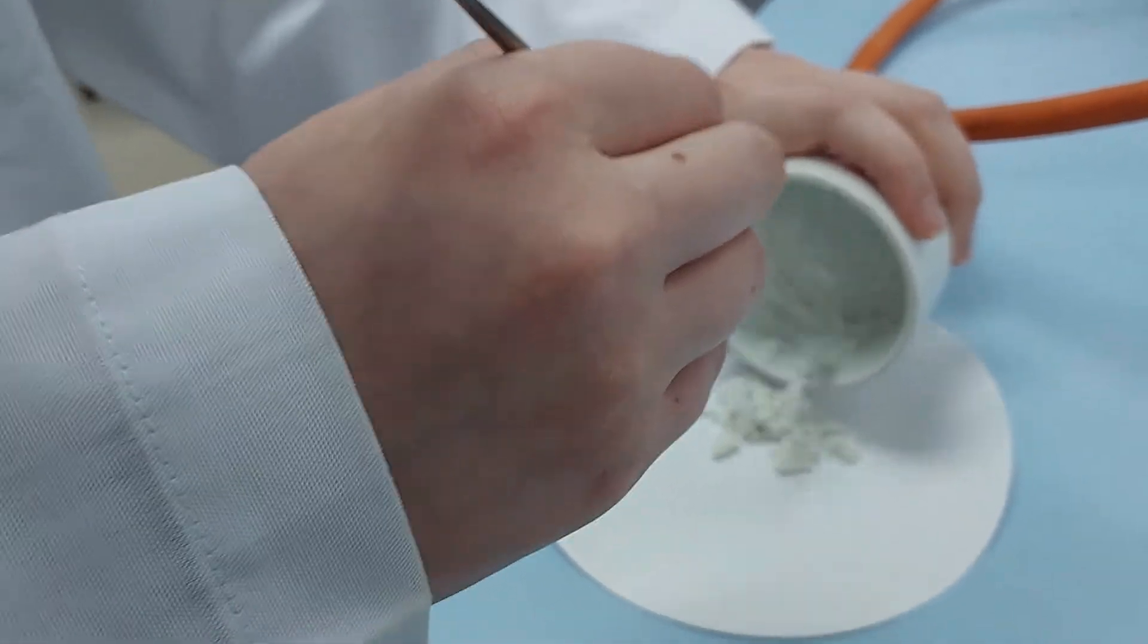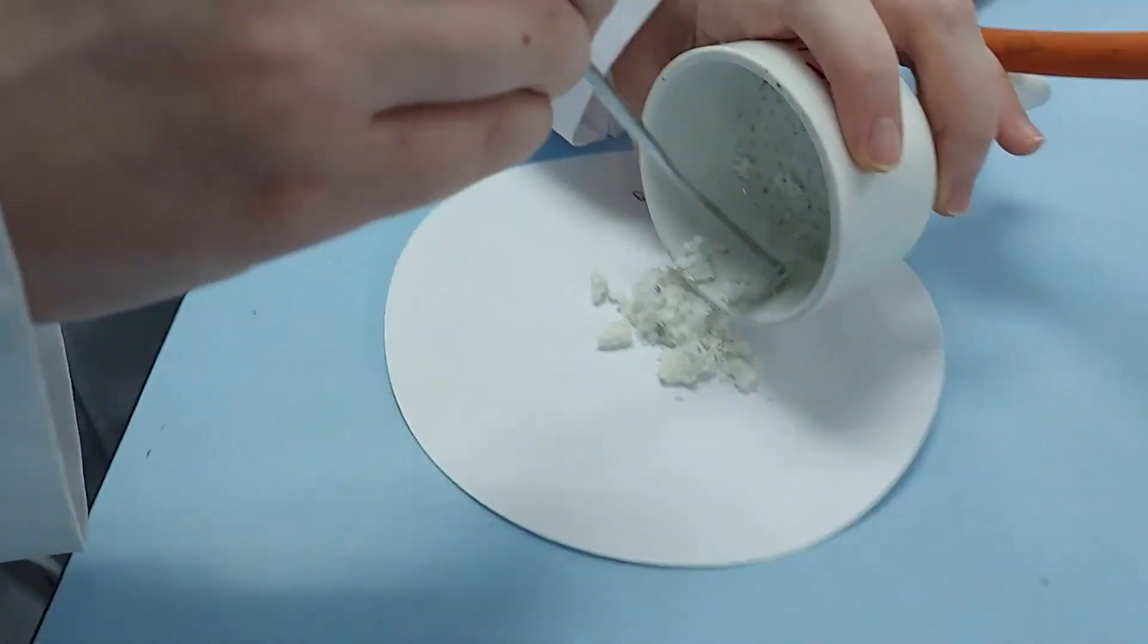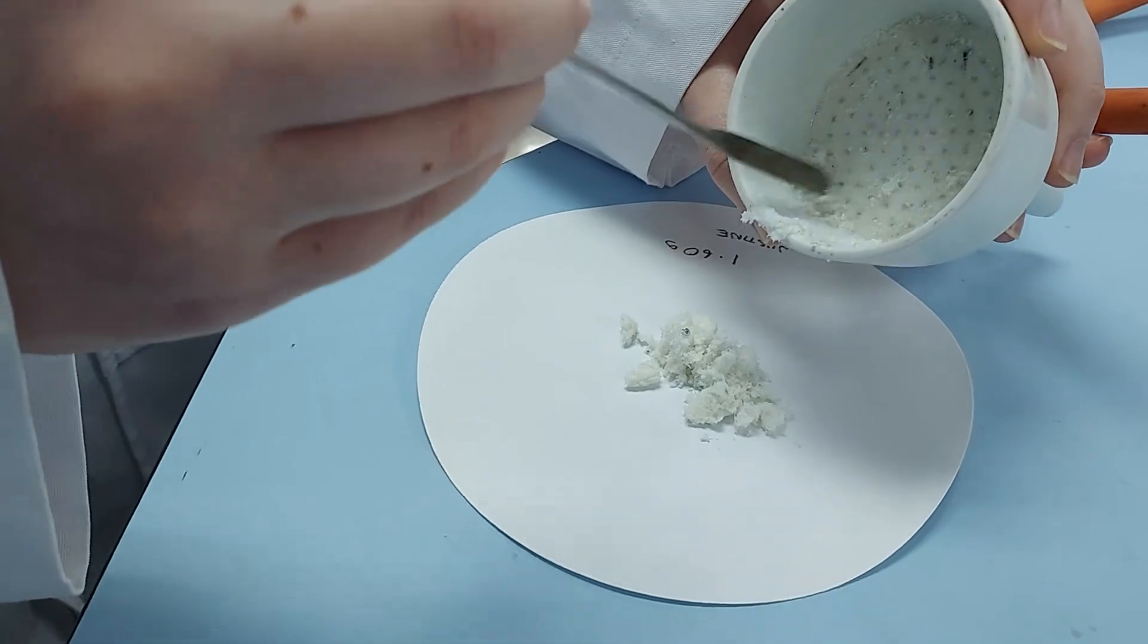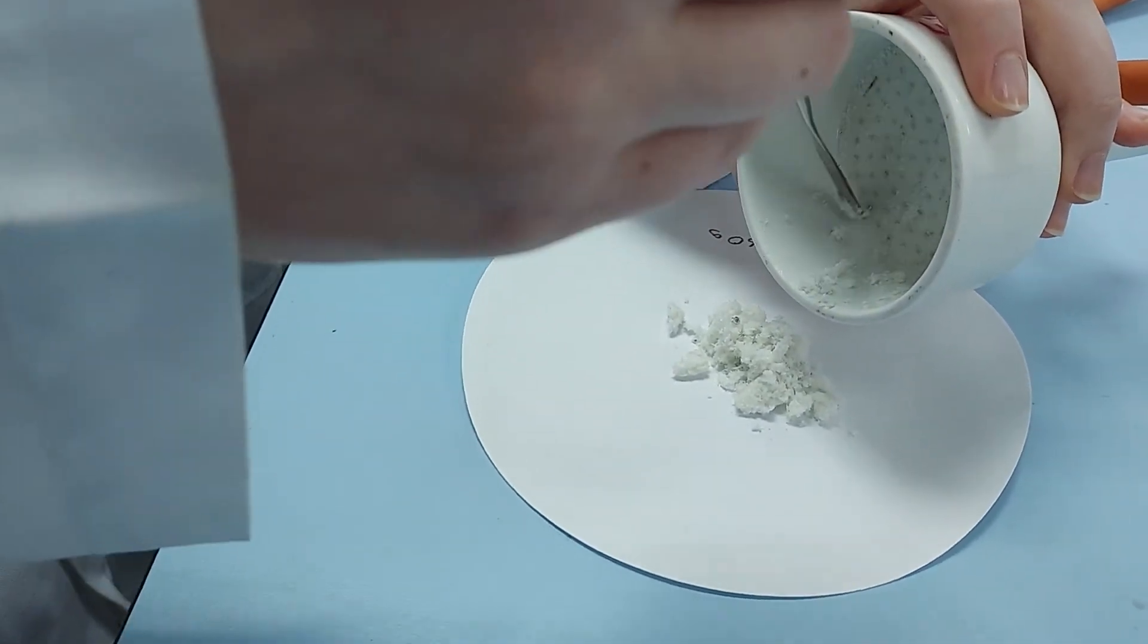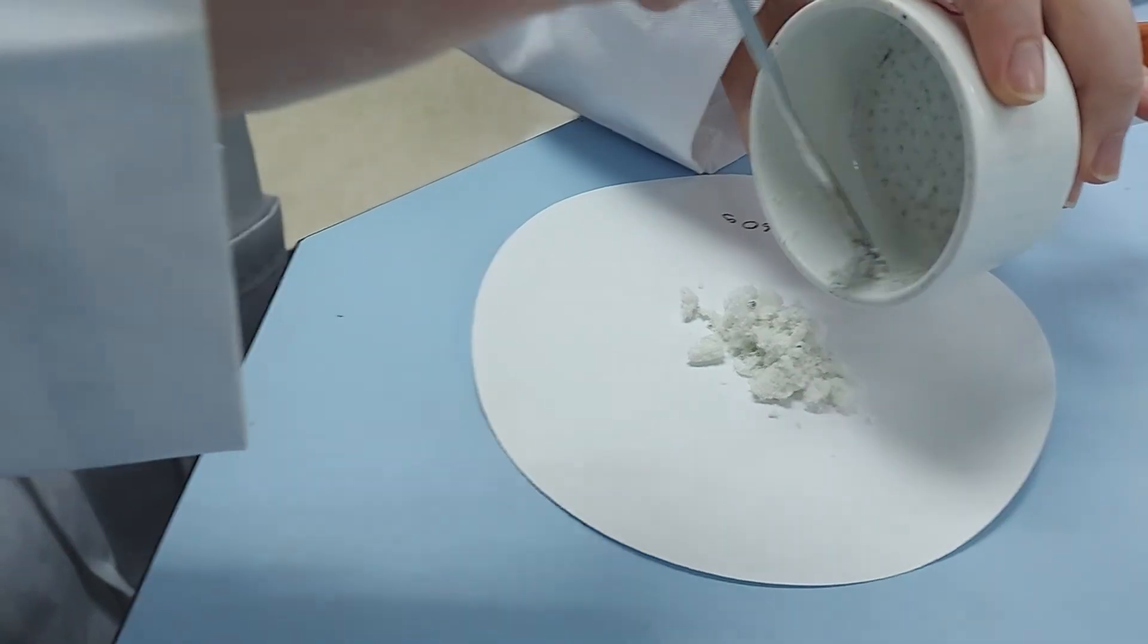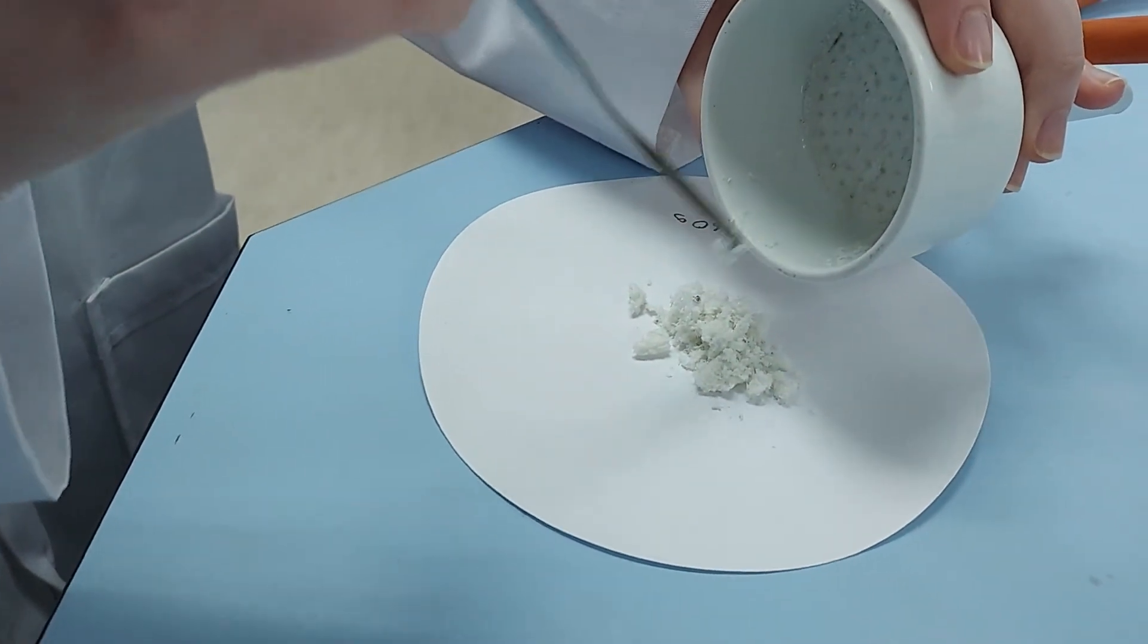So the air dried product has now been placed on a filter paper that's been weighed. We're going to see what our yield is and then this is going to go into an oven to dry.